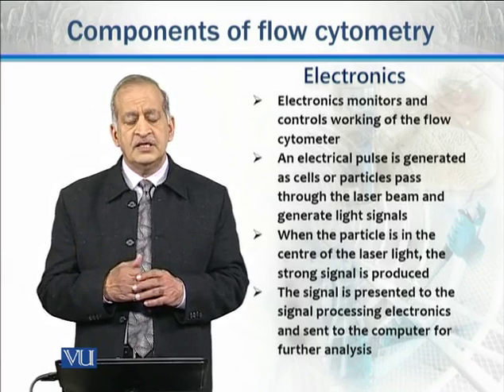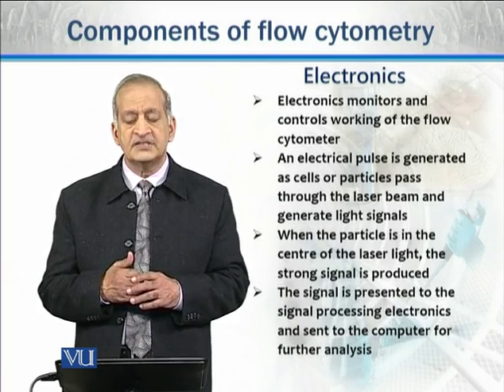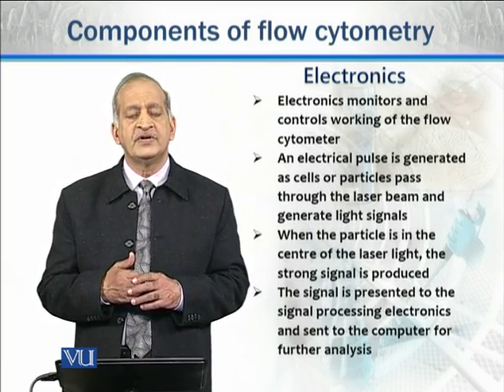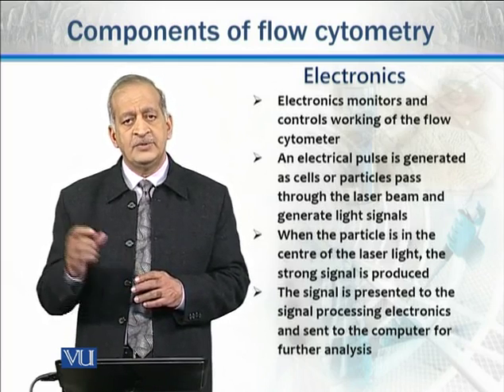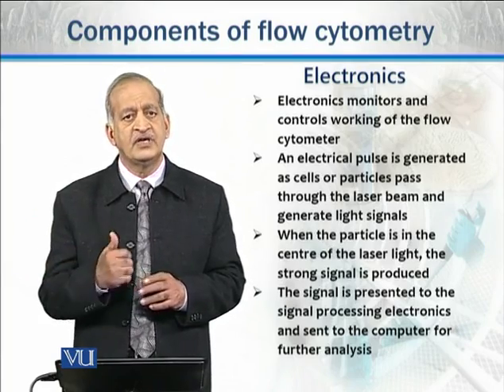And this signal is presented to the signal processing electronics and sent to the computer for further analysis in the construction of histograms or cytograms, like we earlier mentioned.